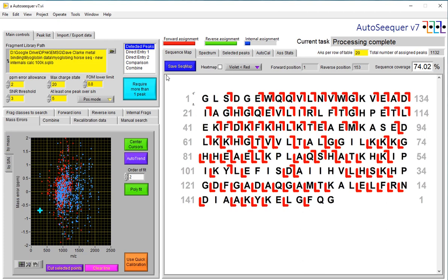Up to this point, we've been using only the 2 main ion series to recalibrate the data. Now, to test the appropriateness of that recalibration, let's search for all the other fragment classes that we might expect to see in this dataset, and then we can see if those fragments also align well with those of the main ion series.